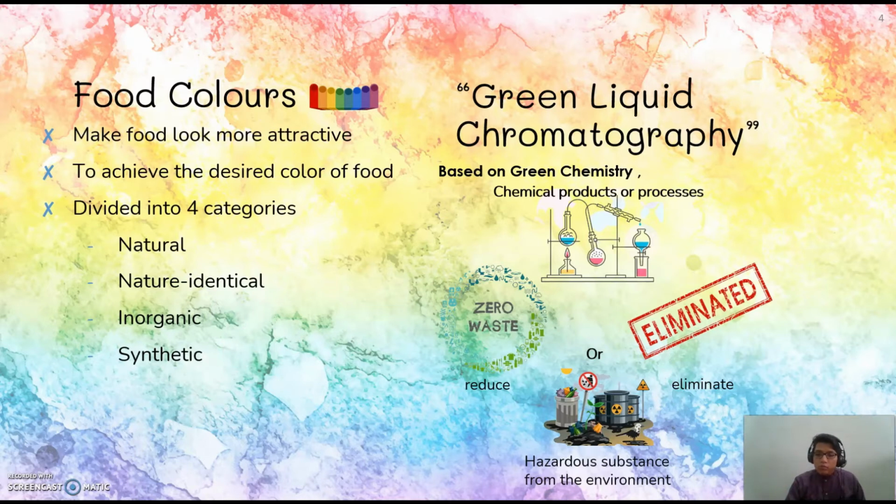In our case, we'll be discussing and focusing on the qualitative and quantitative analysis of synthetic food colorings in Iranian food, such as colored rice, saffron, cookies, and also juice.